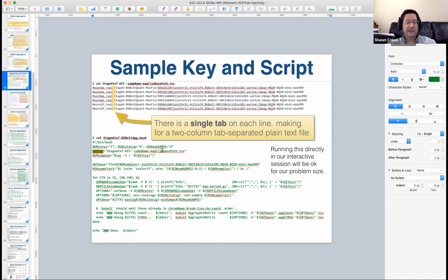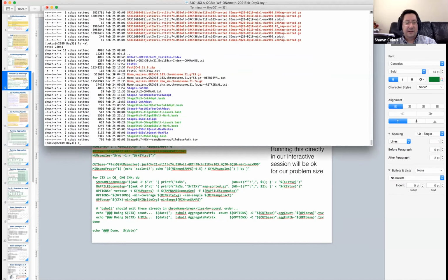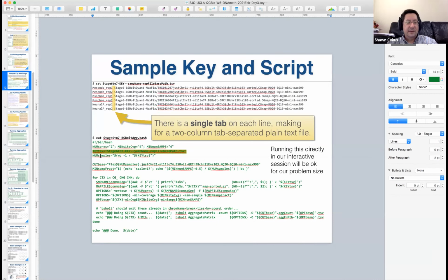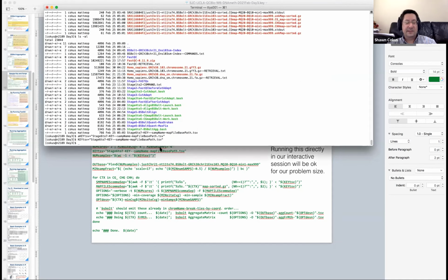So actually, we can sort of pre-flight this by, there we go. I got an extra A there somehow. Where did that come from? Actually, my A key is not only dying, it now seems to actually be sticky. So now sometimes I just get piles of A's everywhere.